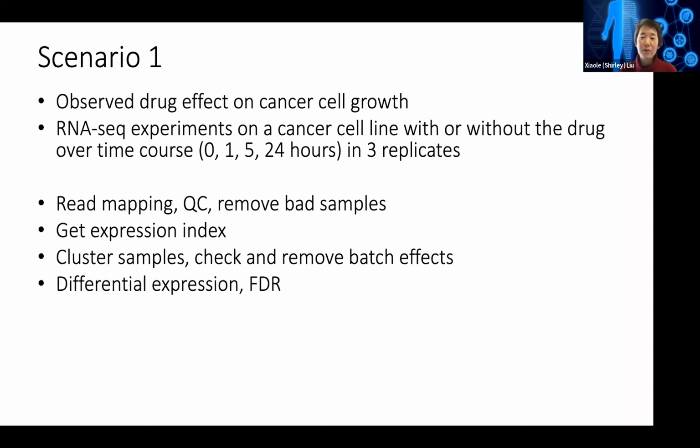After you remove that, you can look at the differential expression, 1 hour compared to 0, 5 hour compared to 0, 24 hour compared to 0, to look at what genes are differentially expressed. And then you can run DESeq2, or you can also run limma to get the differential expression. And then based on that, you might want to run the clustering.